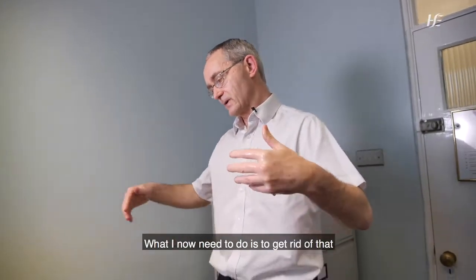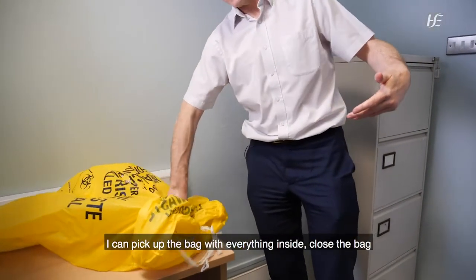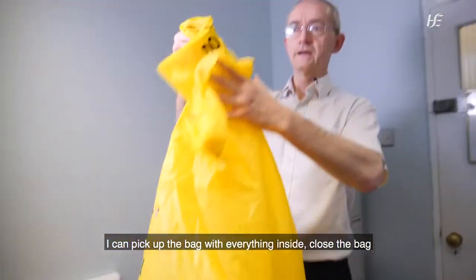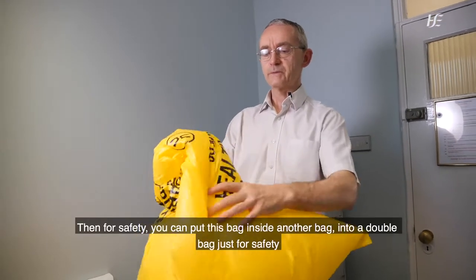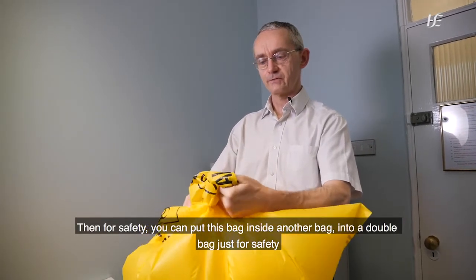What I now need to do is to get rid of everything that is in the bag. So I can pick up the bag with everything inside, close the bag, and then for safety, you can put this bag inside another bag, into a double bag just for safety.